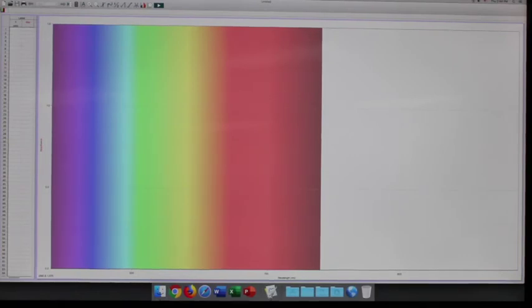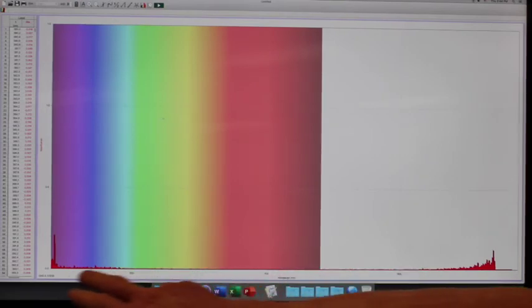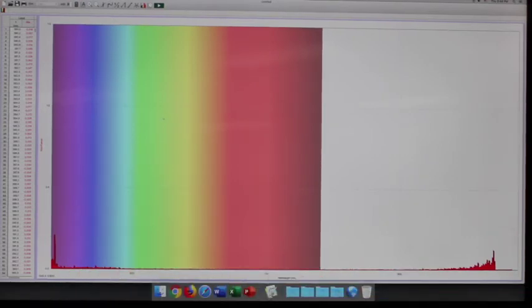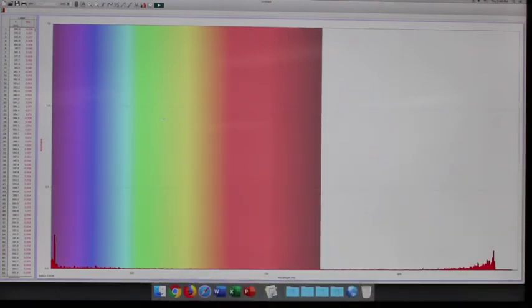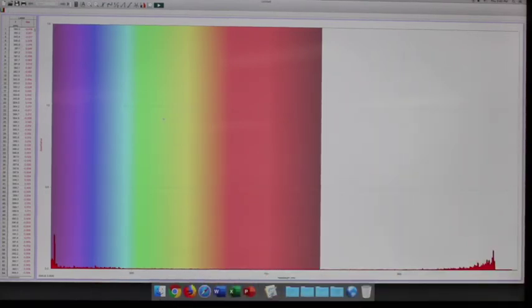All right. Now what calibration is, is basically taring the scale. So if I hit play up here, what we're doing is setting the amount of light that gets through all of the wavelengths of light in water to 0. So water has its own absorbance qualities, and we're basically taring all of that to 0. Now I'm going to take my blank solution of water, take it out, put it to the side, and now find my experimental DI water. This is onions soaked in DI water. I'm going to press play up here.